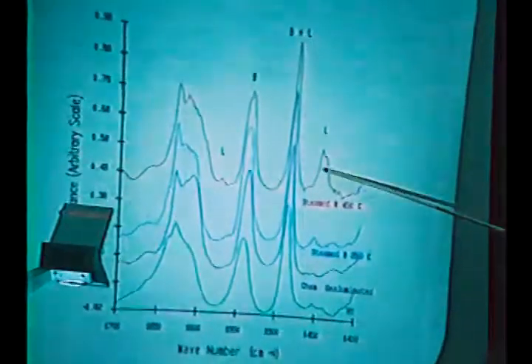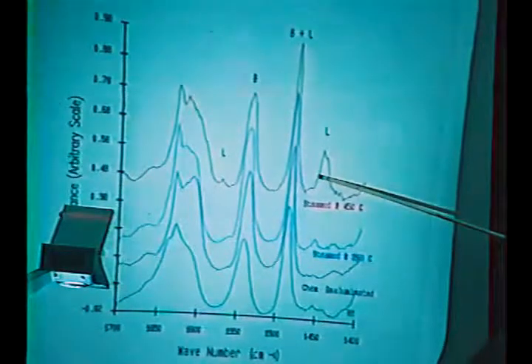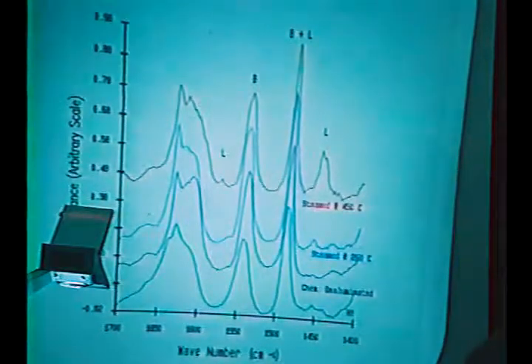But for these two materials, which are really the same unit cell, the steam sample has a significant amount of Lewis acidity, whereas the chemically dealuminated one doesn't. And this we associate directly with the extra framework aluminum.